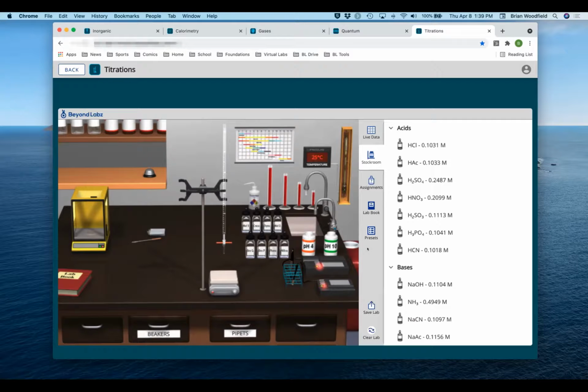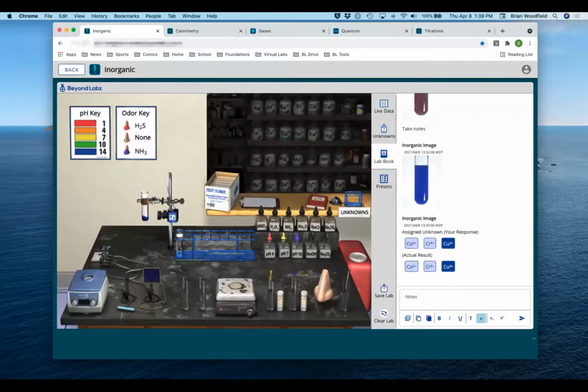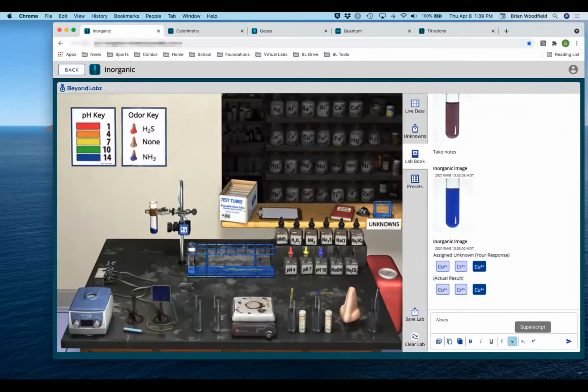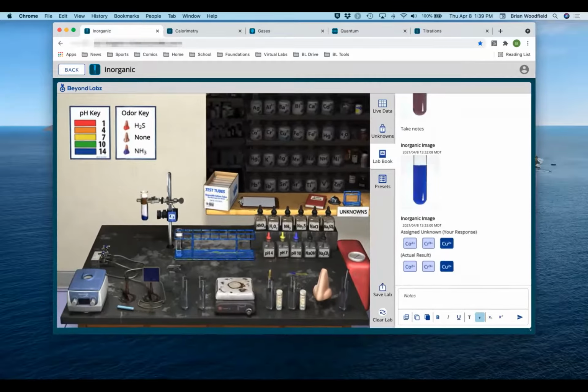Brian, one question that's come up from a couple of people that have worked with the old labs is if you could just show how you can resize the lab now. Really simple thing, but they were very frustrated with sizing. Yeah, so you can resize now. Thanks for doing that. So yeah, we can go to about 150% of the original size. So yeah, it's totally responsive now to reflect that. All right, thanks. Yeah, I forgot about that part.